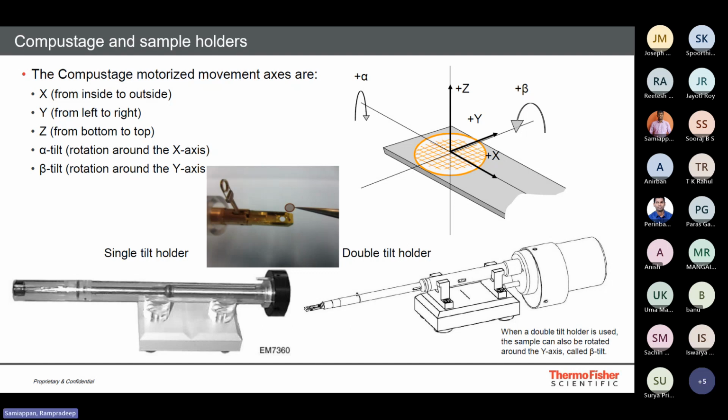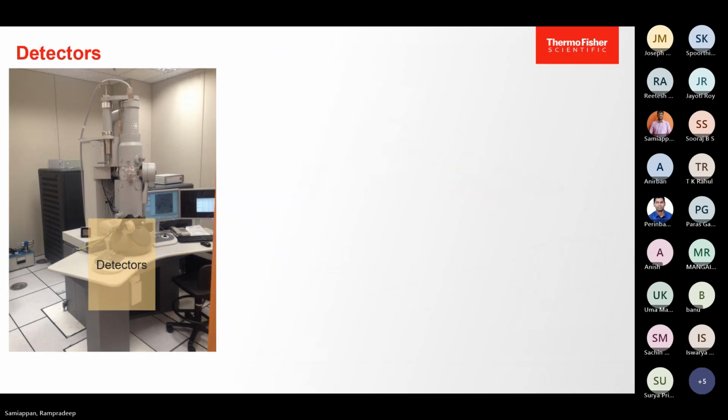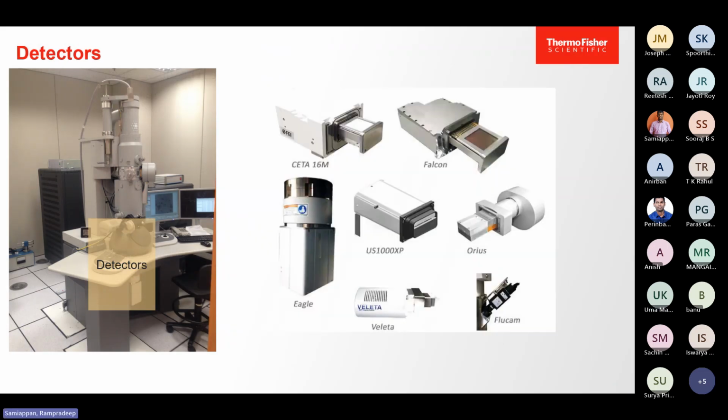The latest one is the ELSA cryo holder. As I said about the detectors, previously we didn't have many detectors, but right now we have the latest advanced types.